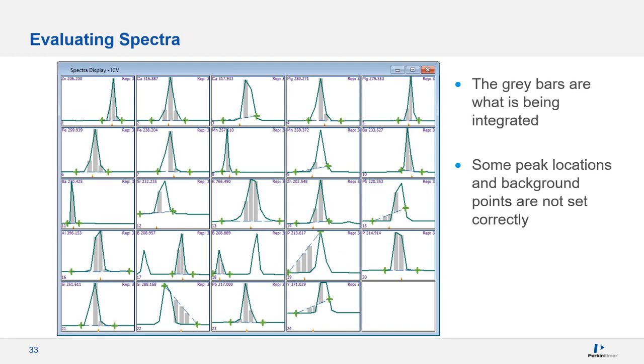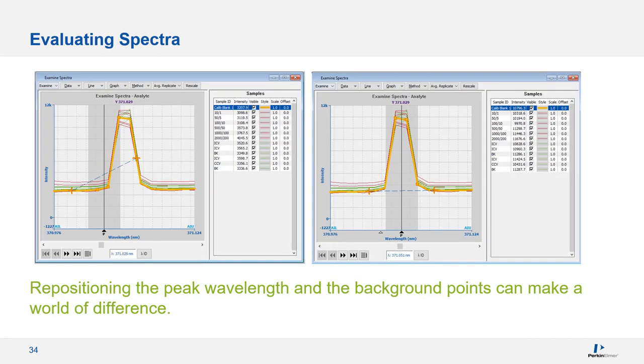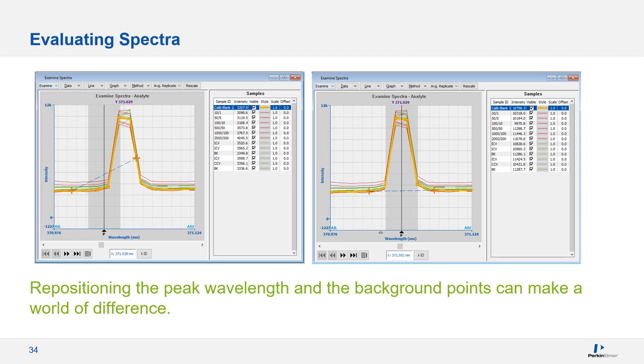Looking at your spectra during a run is another troubleshooting tool that can help you find problems. Several of these peaks have positions and background points that are not properly placed, which means the intensities are not being properly recorded. The peak shown in these two screenshots is actually yttrium, which is being used as an internal standard. This means that the poor result from the bad peak position and background points on the left screenshot is affecting every analyte that uses it as an internal standard. So, fixing this one peak makes a huge effect on the results that you see in your entire run.